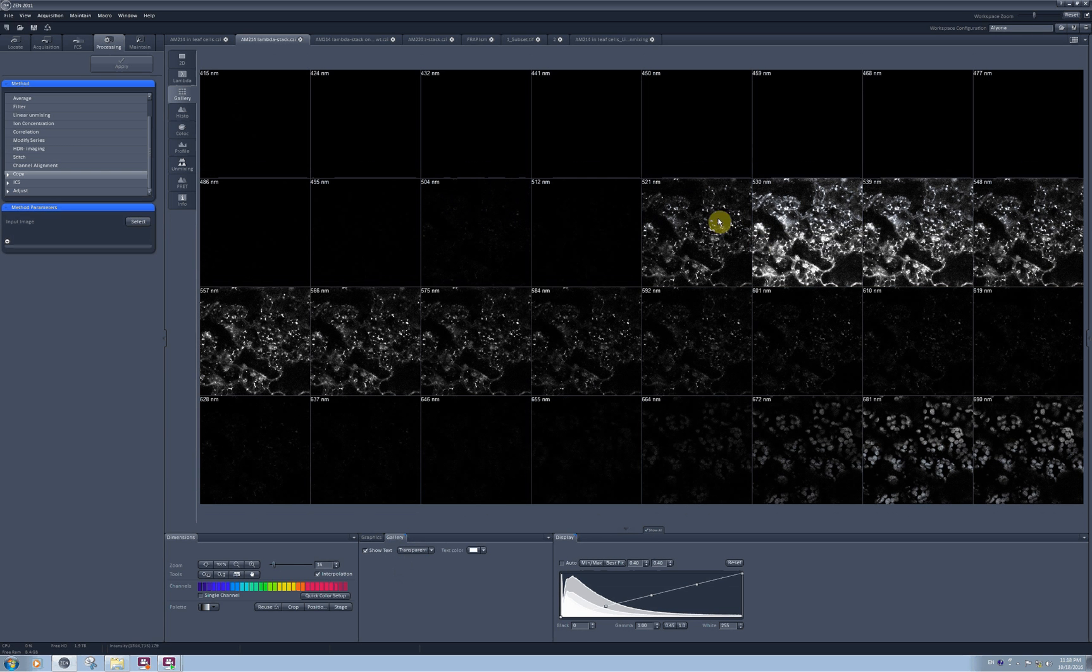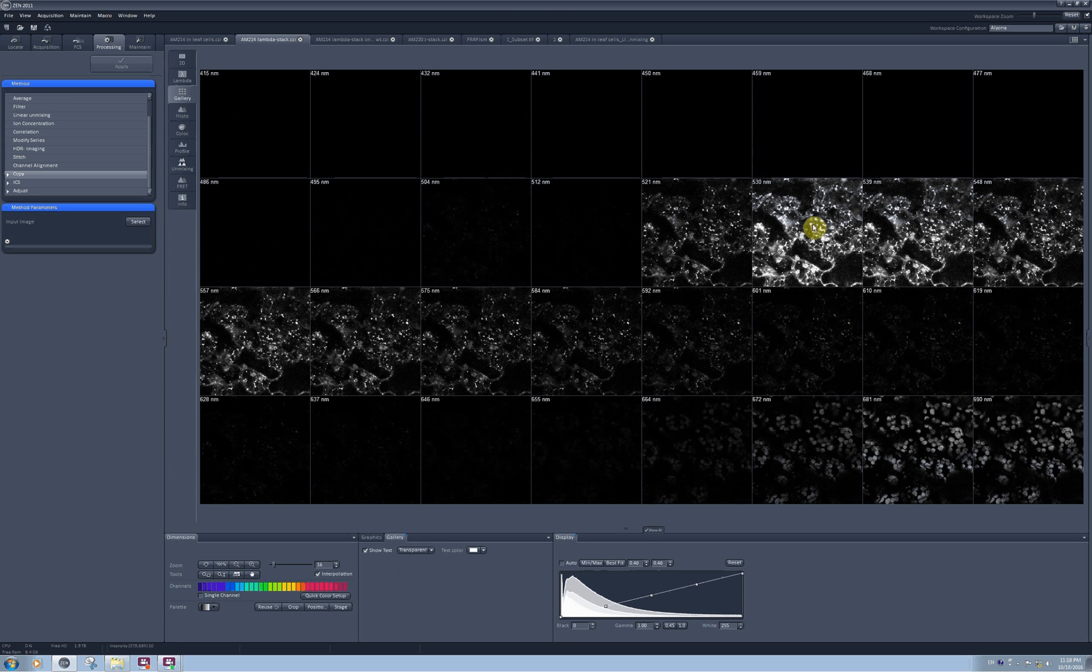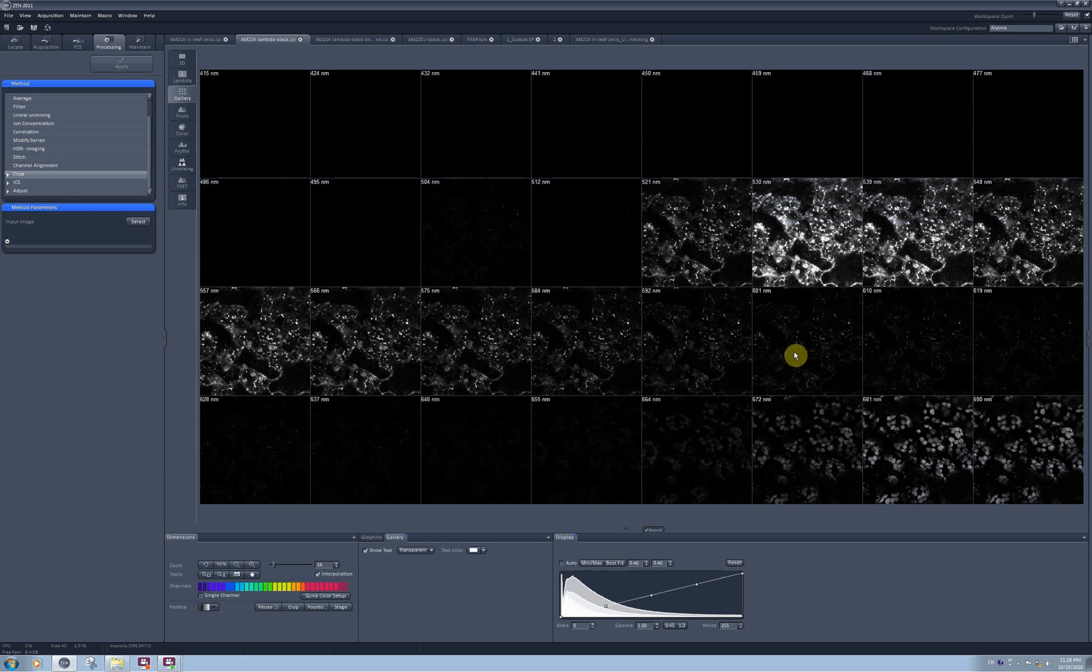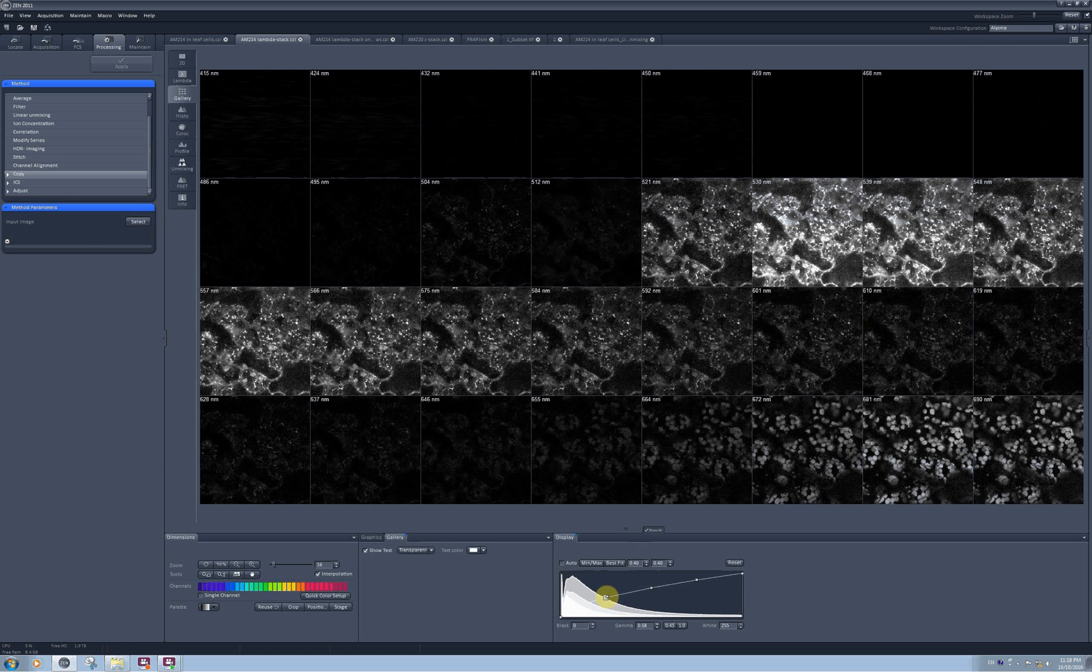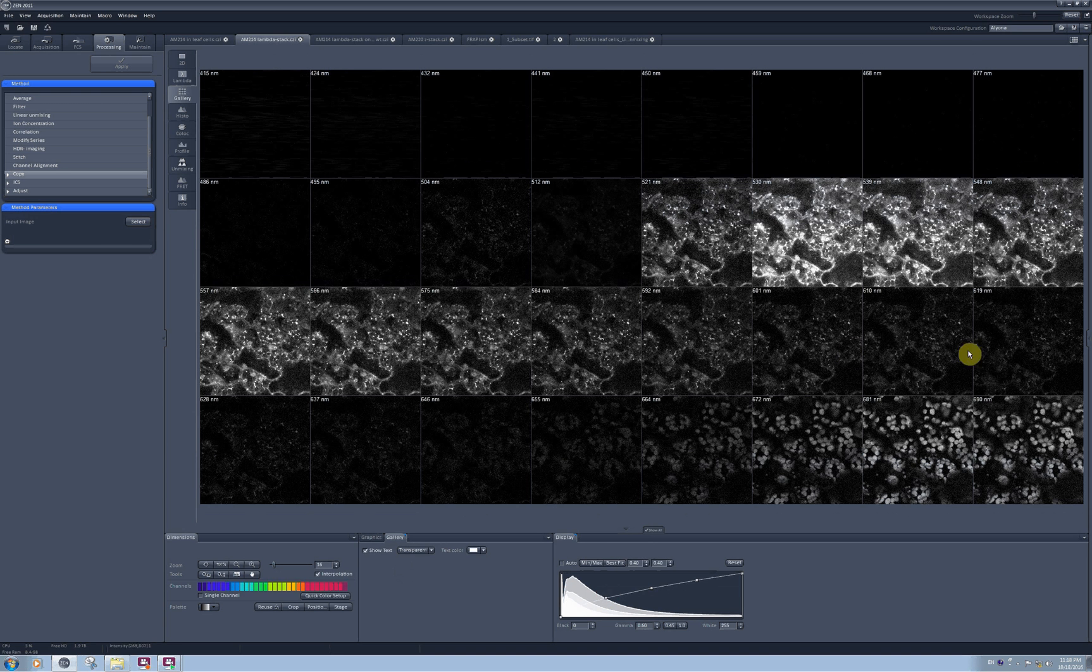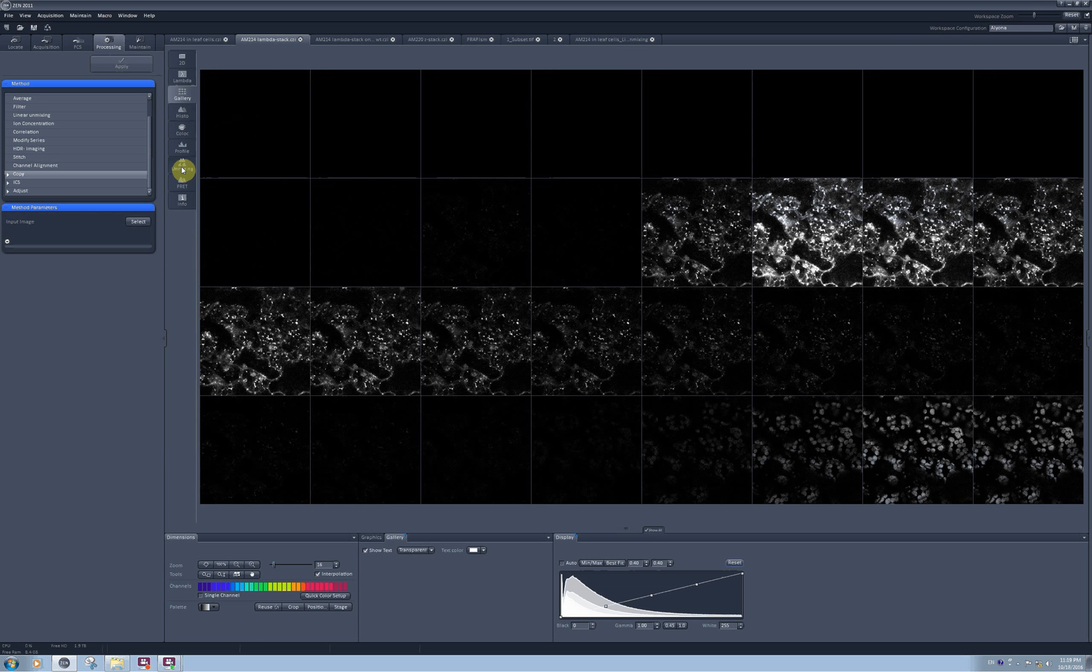It is quite obvious from this lambda stack that I have two fluorophores, one shows up somewhere around 540 and another shows up after 680. But it also is quite obvious that the tails of their emission spectra do overlap, and this is why I will need unmixing. So again, as I just did with a previous image, I proceed to the unmixing tab.